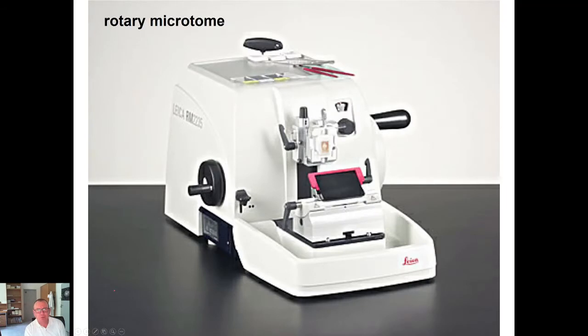Another microtome is a rotary microtome, where the laboratory assistant doesn't slide the knife, but she or he rotates this handle, and the tissue block, which is here in this case, is moving along the blade situated in this red holder.